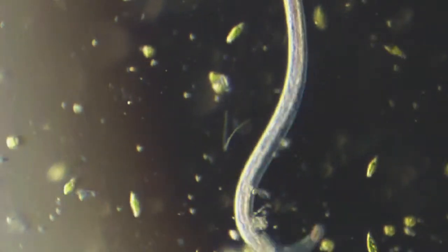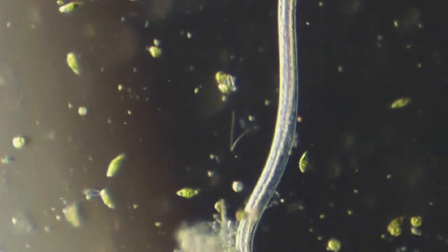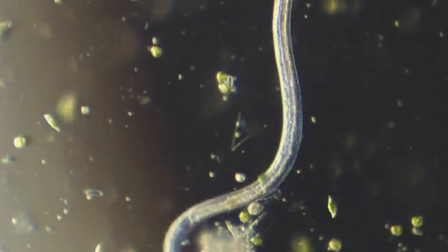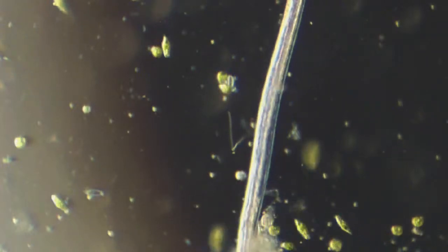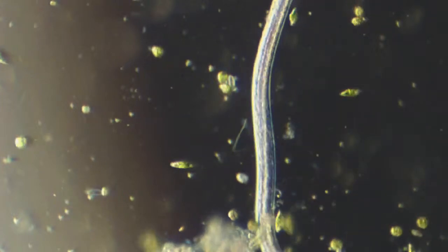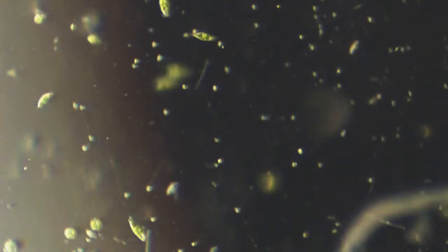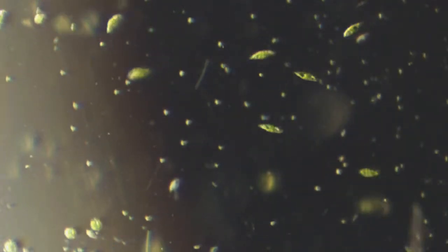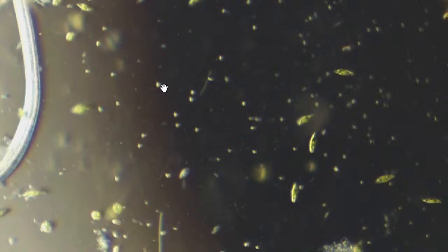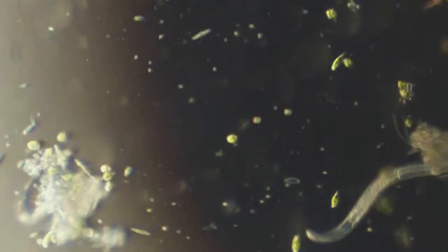There's a slower one. You can see inside the gut there if it stops a little bit. Yeah, the nematode's dancing on the beat, right? It's the nematode dance party. Come join the fun. Zoom out a tad. You can see a couple at once here. Where'd they go? I had two next to each other.